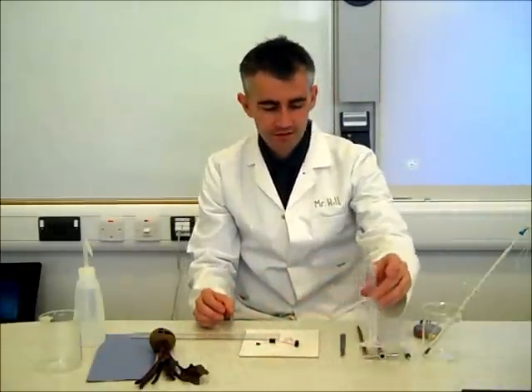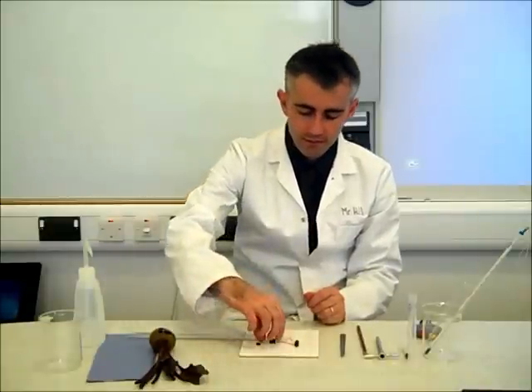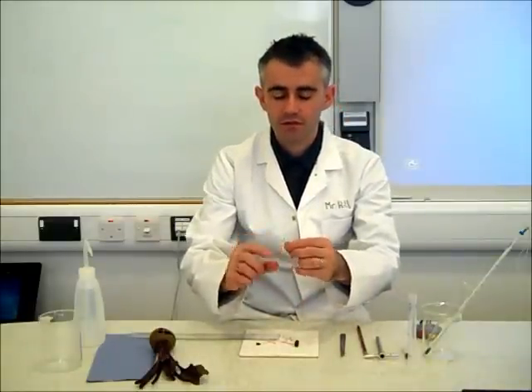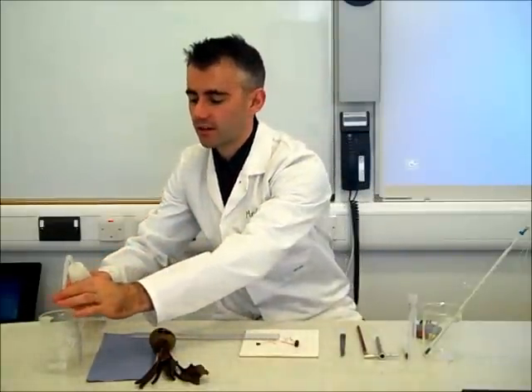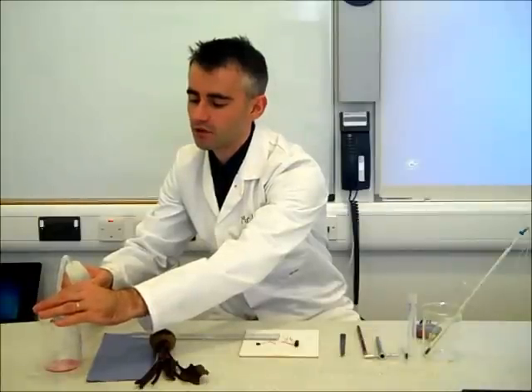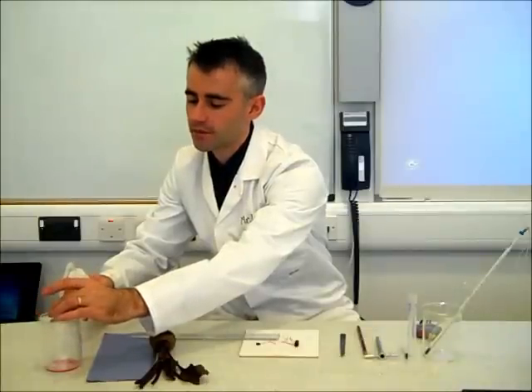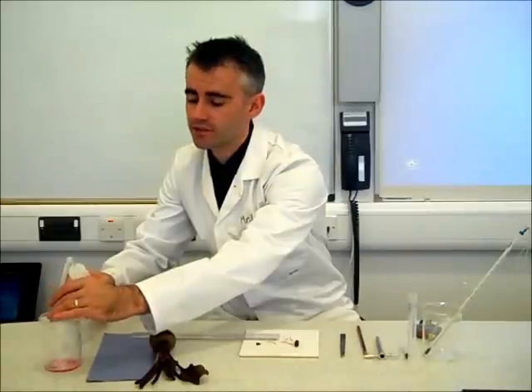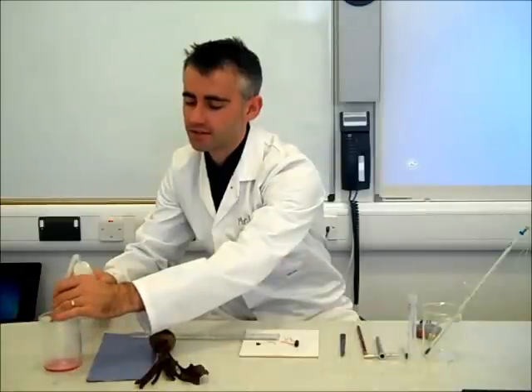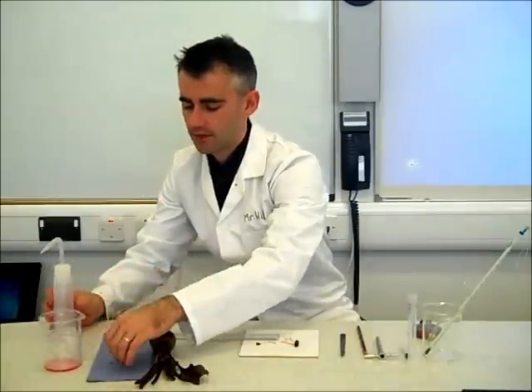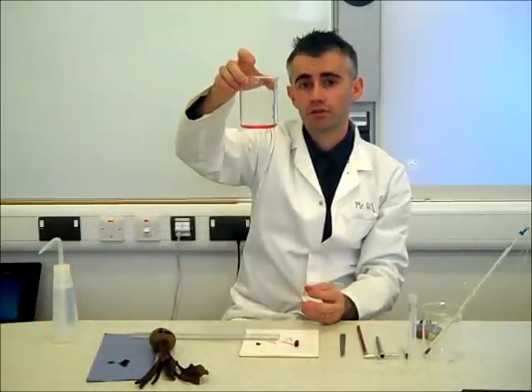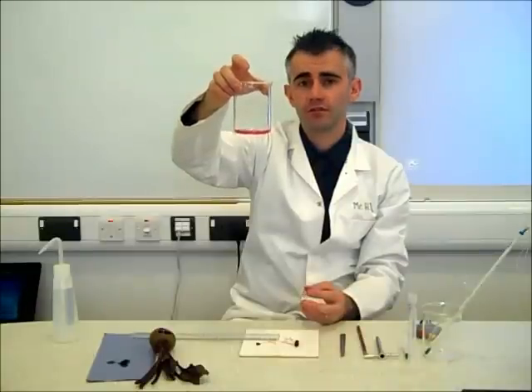There is my one centimetre section of beetroot. You can see that from the cutting process there is already some pigment on the outside of the beetroot. I'm going to rinse that off with some distilled water — I'm purposely using distilled water and not tap water. Think about why that would be. After a good rinse, I'll leave it on tissue to dry. You can see the significant amount of colouration in the wash water from the cutting process.